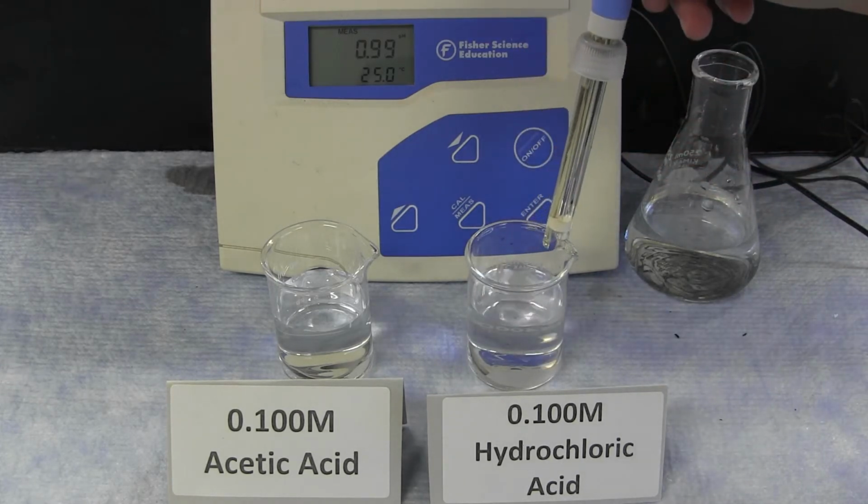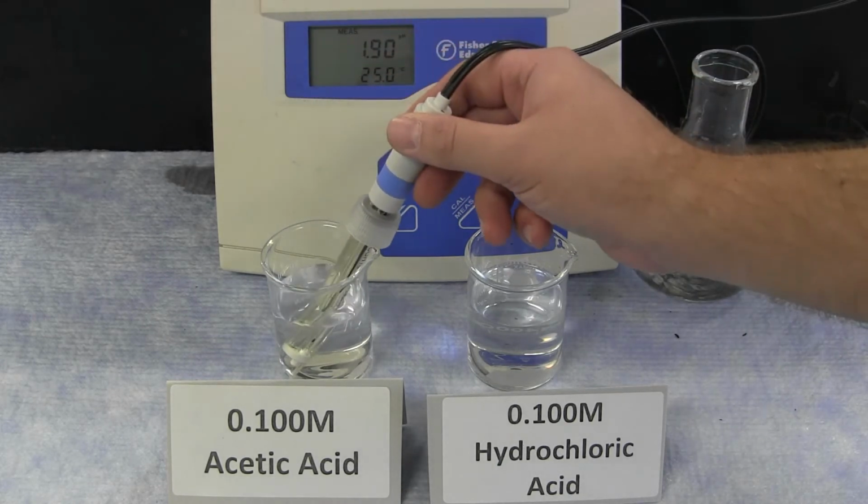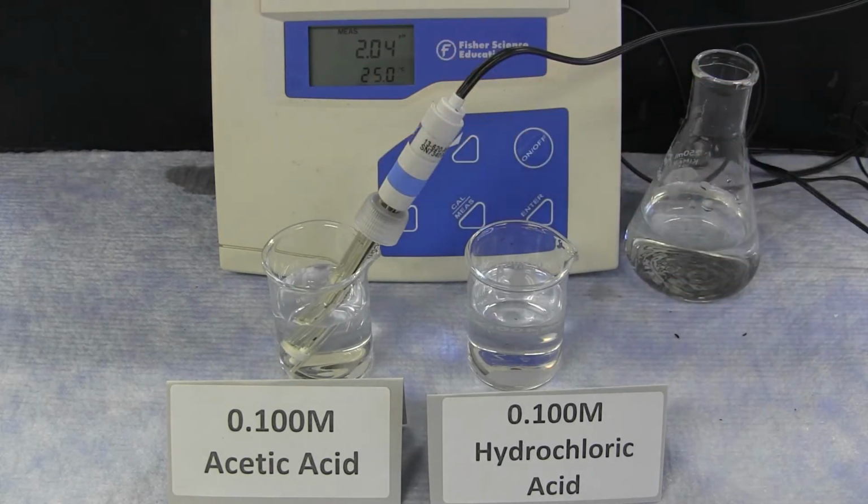However, when the pH meter is placed in the acetic acid at the same overall concentration of 0.100, the resulting pH is now over 2. This is because acetic acid does not fully ionize.